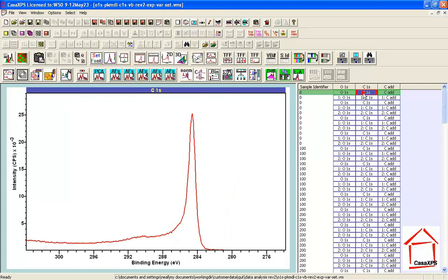The Carbon 1S — and this is typical — there's lots of signal, but the asymmetry associated with the carbon and also satellite peaks all contribute to confusion in what is Carbon 1S signal bonded to carbon only versus carbon bonded to Oxygen. So we would expect the changes to occur in a zone which is quite difficult to understand from the Carbon 1S.